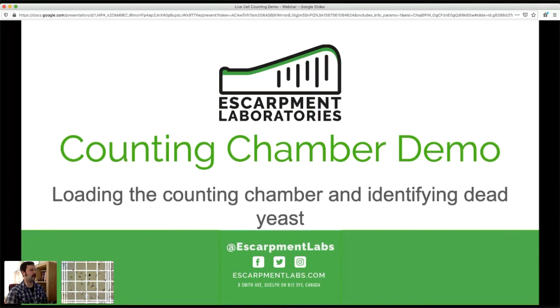The counting chamber demo, I technically did that already, so we're going to pass through that. But again, just remember, that's what it looks like, identifying live and dead yeast.